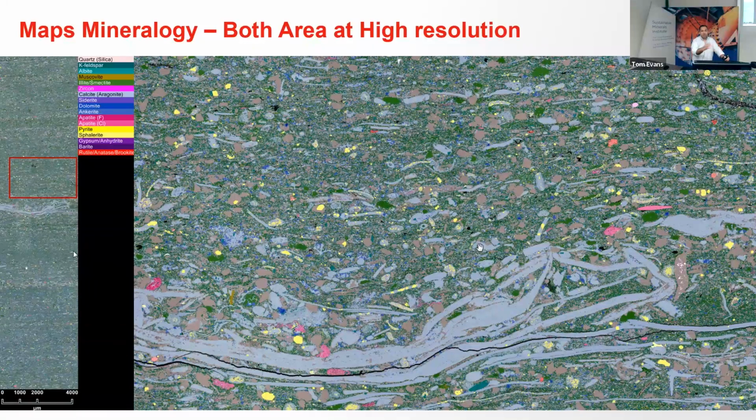And on the EDS, we don't have any limit in how many X-ray points can be acquired. So the two limitations that we have are basically large file sizes and the fact that you're acquiring for longer periods of time. You can make acquisitions as fast as you like, but you can make them very, very, very long. But that's kind of a good thing, from my point of view. Like the computing, and also the classification, it takes longer to classify, to identify the minerals.